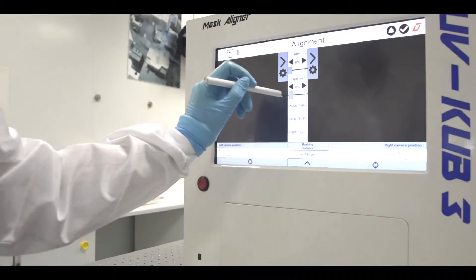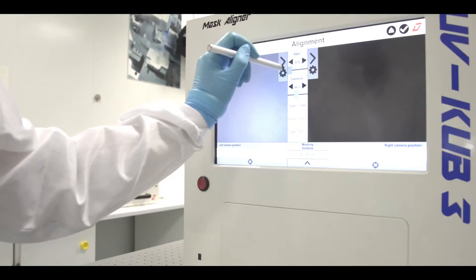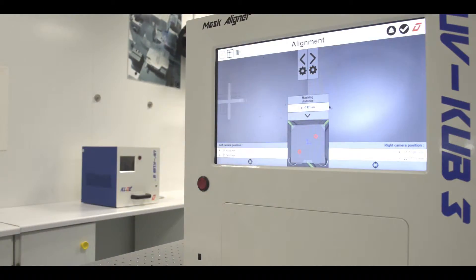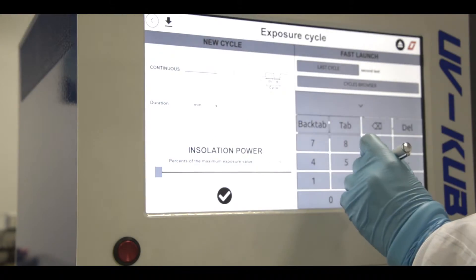A minimum increment of 0.4 micrometers using the digital zoom and the pad enables you to finely adjust the alignment along X, Y and Theta to achieve alignment precision of under 2 micrometers. The onboard computer can be used for metrology, image capture and the management of a database.